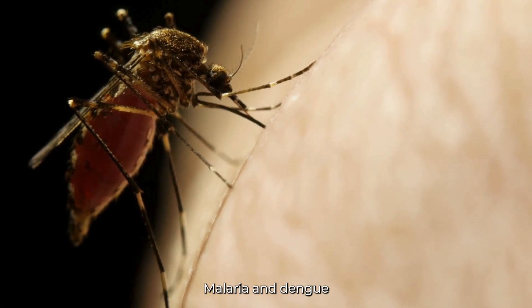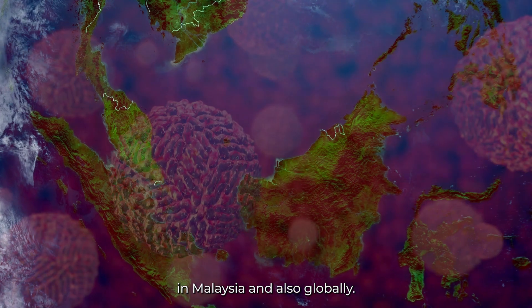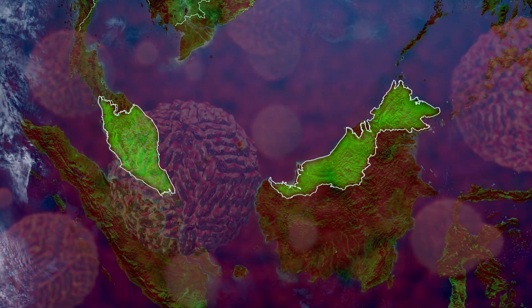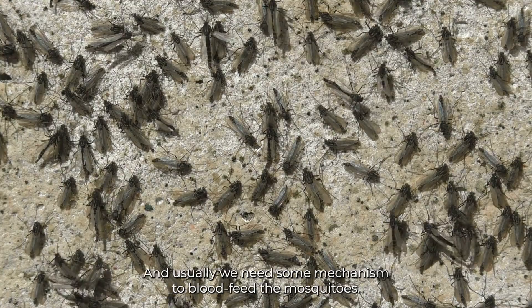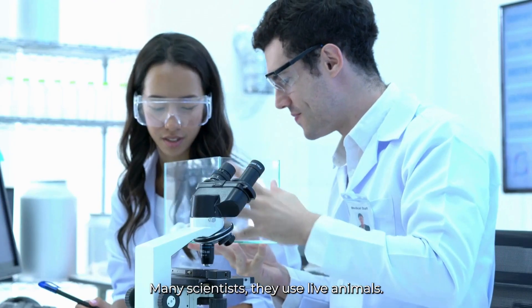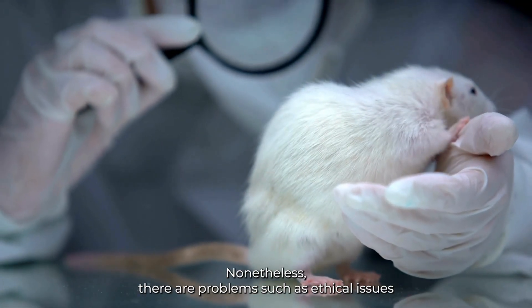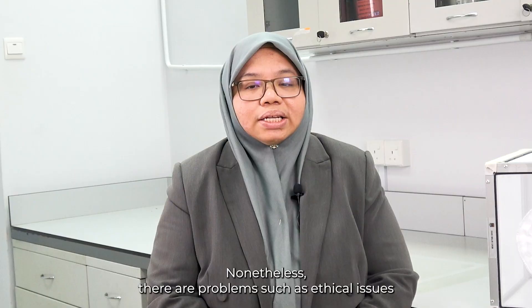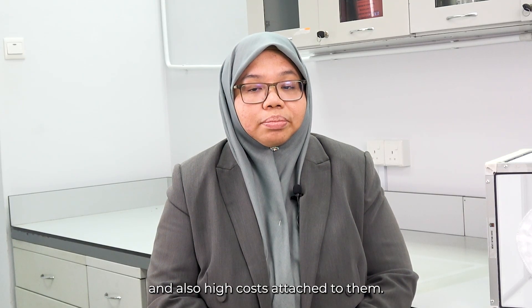Malaria and dengue are still concerning diseases in Malaysia and also globally. To control them, we need to study the mosquitoes, and usually we need some mechanism to blood feed the mosquitoes. Many scientists use live animals. Nonetheless, there are problems such as ethical issues and also high costs attached to them.